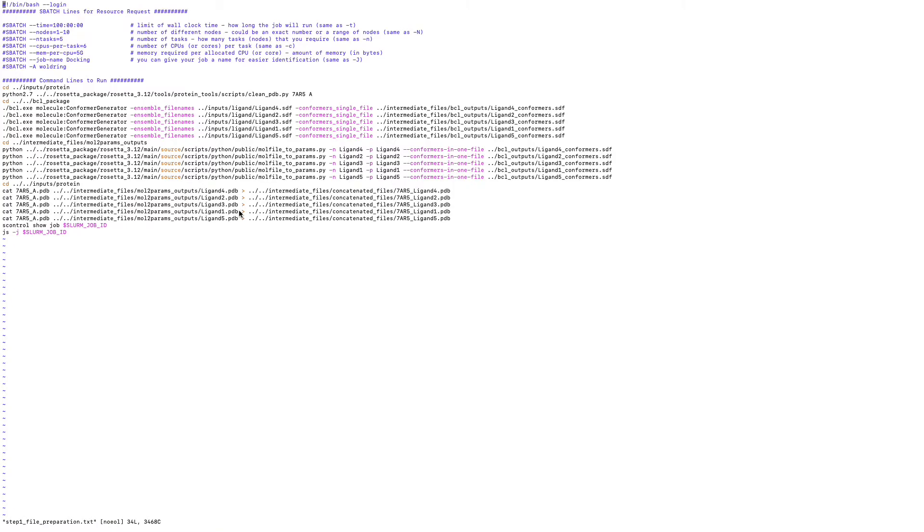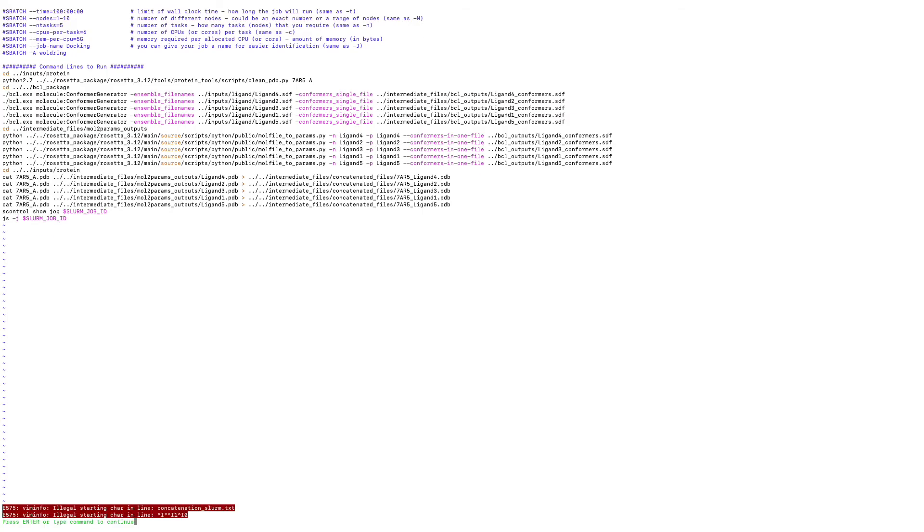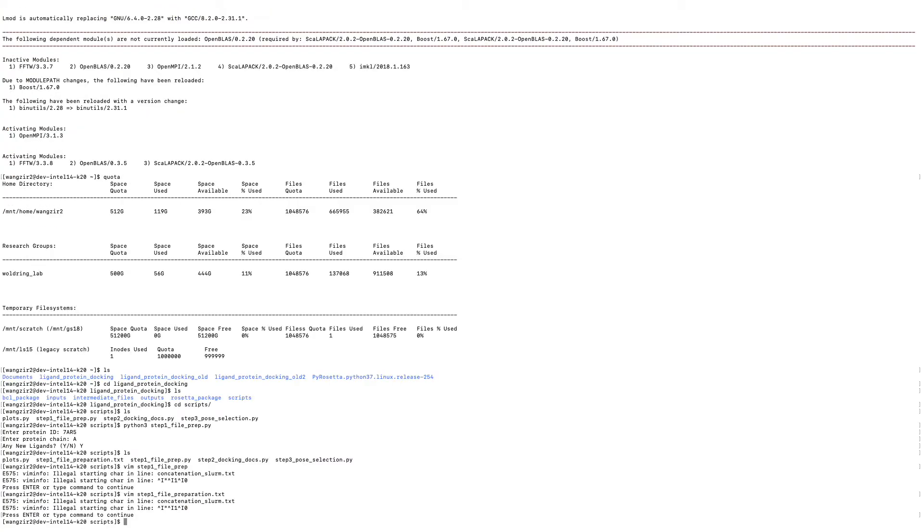And then the last step is going to concatenate those files. I mean like the protein and ligands file together. And then the job stops. Okay. Let's quit. And let's go ahead and run this job.